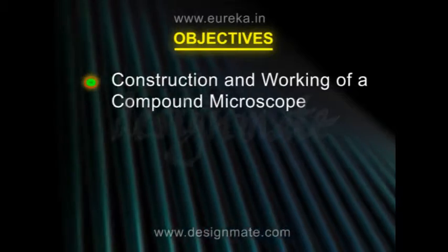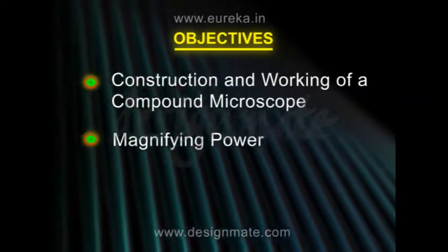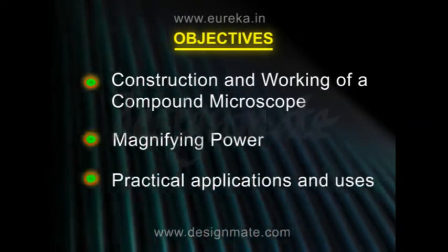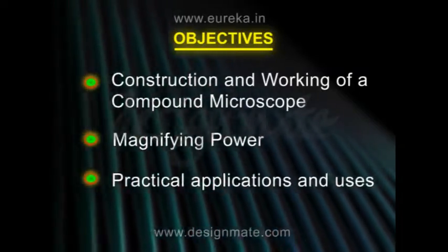Compound microscope. Objectives: to study the construction and working of a compound microscope, to discuss its magnifying power, to understand its various practical applications and uses.